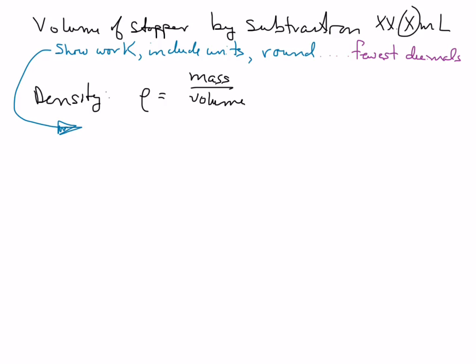Most balances have a tare feature, and the tare feature here is the yes part. It says right in the middle. If you hit that, you'll see it go blank for a minute, and it's basically tared out. Tared out and zeroed out are the same thing. Our scales are pretty nice. They've got these enclosures to stop air currents. So I put my thing in there, close it up, let it settle down, then read that back and write it down.